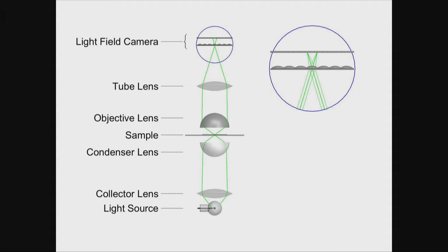He had the idea, why don't we, instead of making this large array of cameras, put in a single camera with a single regular macro lens, a micro lens array in front of the CCD or CMOS sensor, so that you have about, let's say, 16 by 16 pixels behind a micro lens, and the sensor is one focal length away.